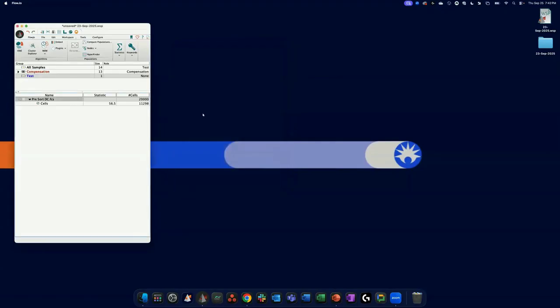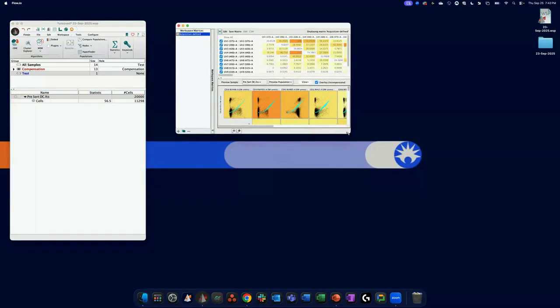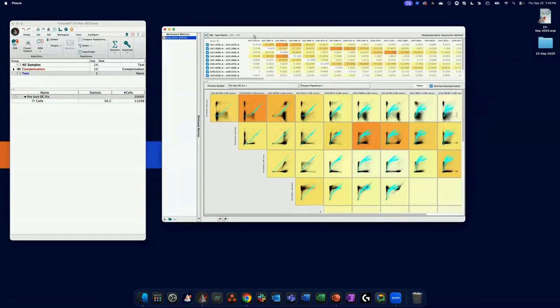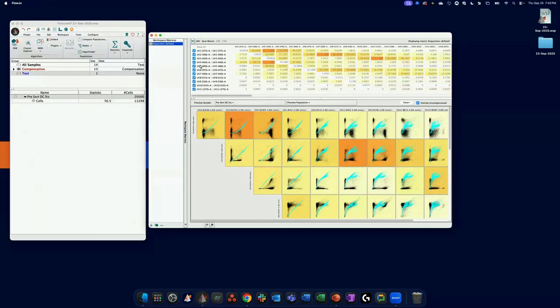Now, if you calculated unmixing at the cytometer, there's generally no need to redo it or edit it, if everything went well at the machine. If you want to peek at your matrix, you can do that. You'll have this matrix icon beside the unmixed file. When you double click it, you're brought to the matrix preview. But this is a little hard to interpret at times because of these UV detector assignments that we talked about. So if you see this, don't panic.